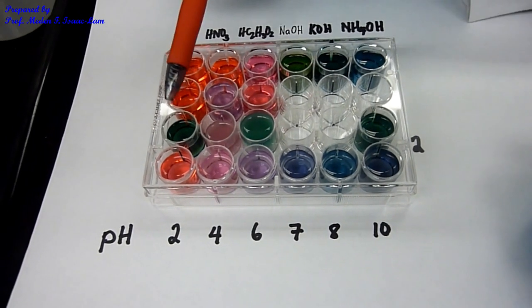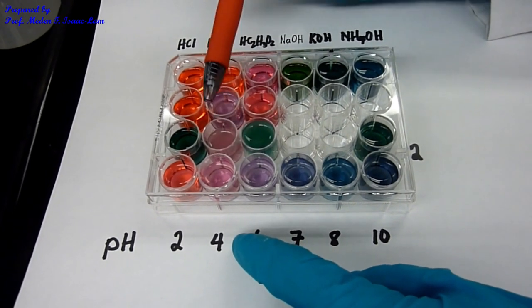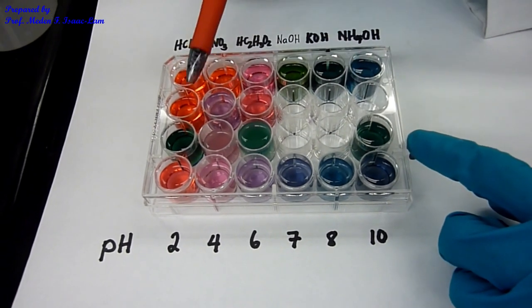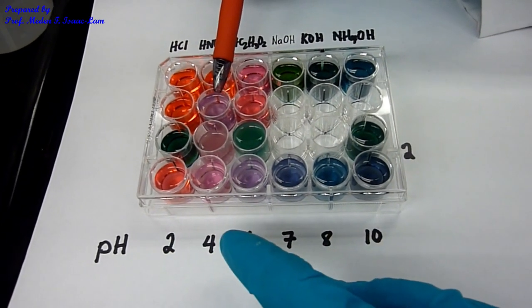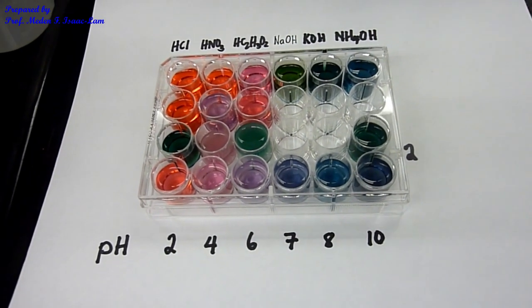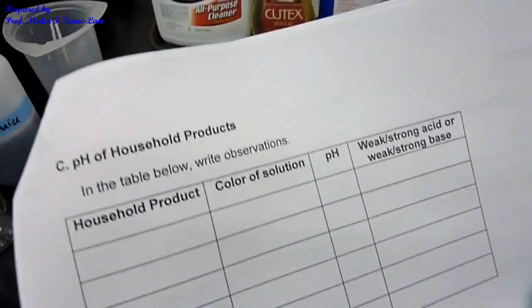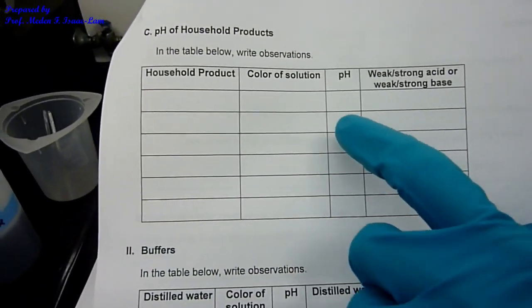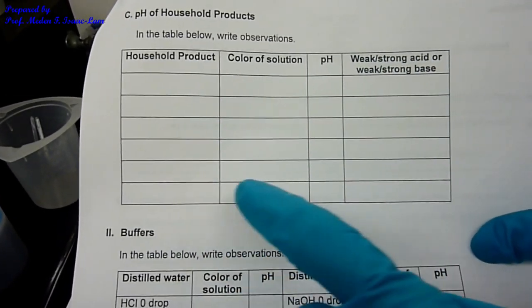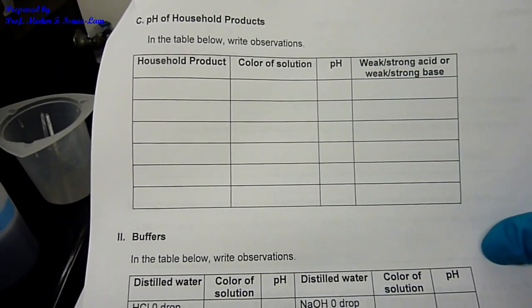So let's review. 409 formula, this color. Cutex, more like this color here. This one, this color. This one, more like this. This one, that one. So that's basically it. And then you have to identify in this table the pH corresponding to that color, and whether that product is a weak or strong acid or weak or strong base.